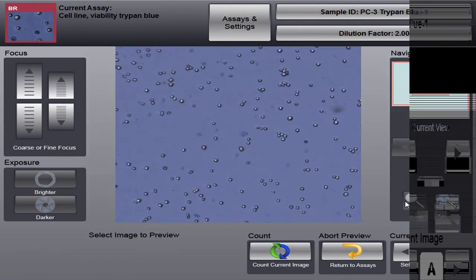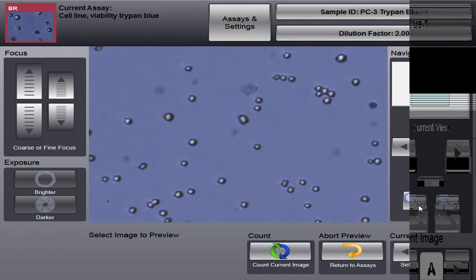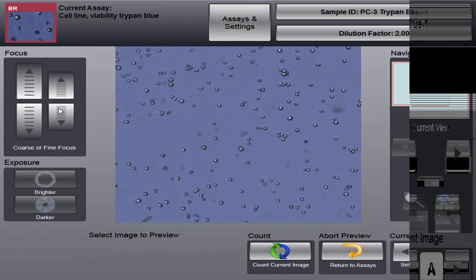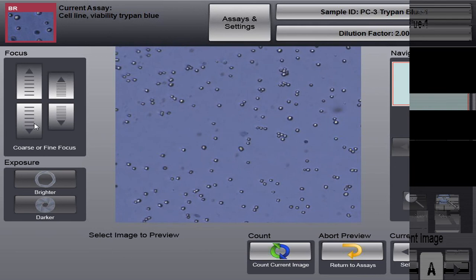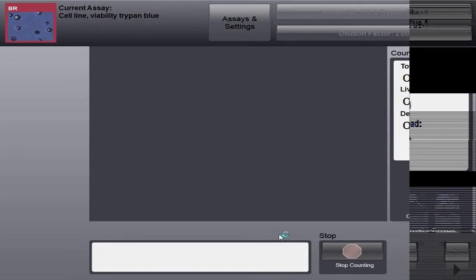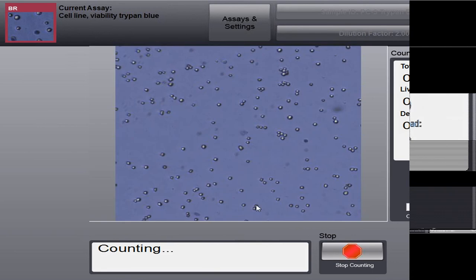And you can see, again, going back to focus, we don't need to change the focus. It stays in the correct focal position for these cells. It's a different sample. First, we counted Jurkat. These are PC3. But again, if you need to change the focus, you can use the coarse and fine focus adjustment to get the best focus for your image. So once we're ready to count, we're going to click Count. It's going to analyze A through D and give us our results.